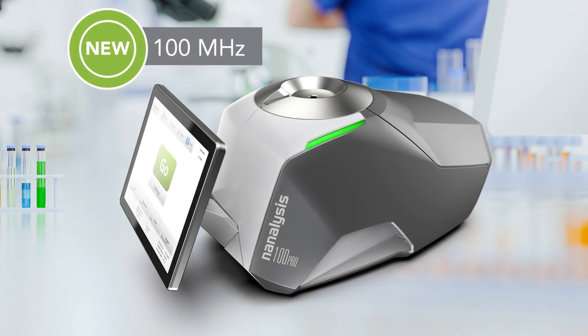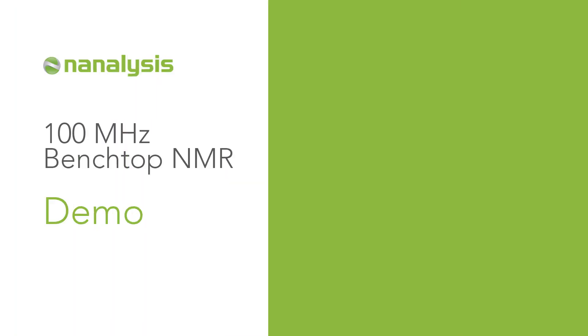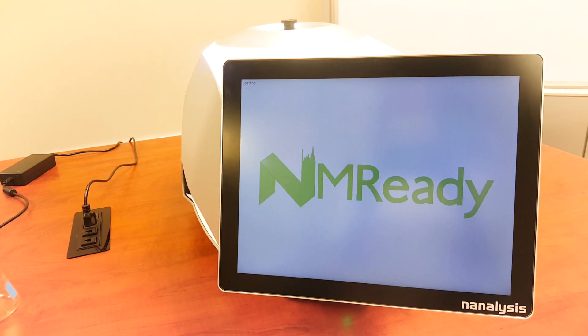We're excited to introduce our 100 MHz Benchtop NMR spectrometer, the most powerful benchtop NMR spectrometer available on the market, offering 25% more resolution than our closest competitor.